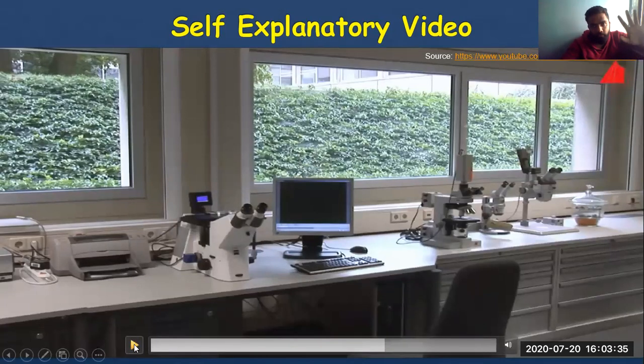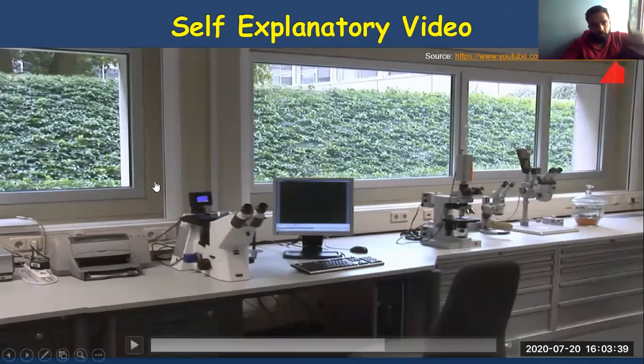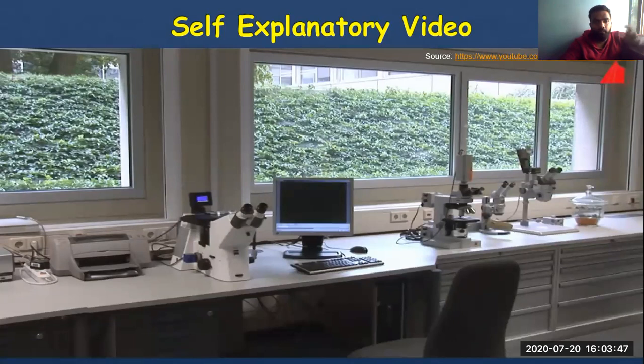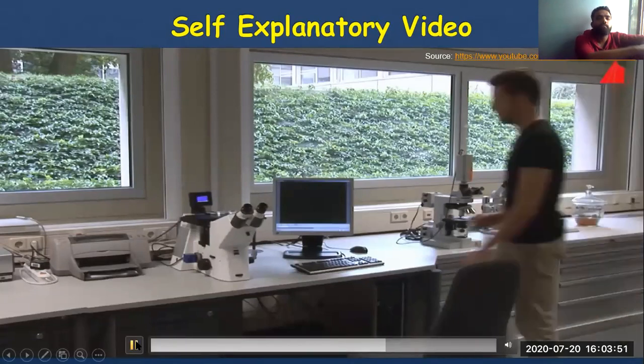I hope you people are finding it interesting. You might find it interesting only after you have heard about the theory that I told you at length. So he has not yet used the etchant. He has only dried after polishing. Just see the results. Or rather, onto the microscope.